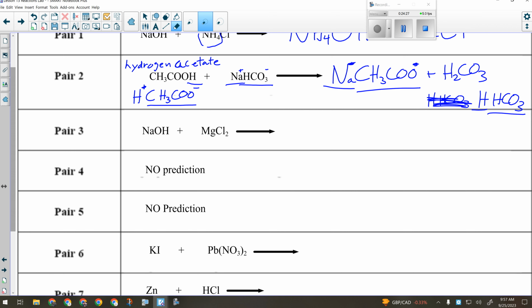Now, what's the other name for sodium hydrogen carbonate? You probably have a box of it in your fridge. Baking soda. What two things are we mixing together here? Vinegar and baking soda, except we're using lab grade. What did vinegar and baking soda do when you mixed them together when you were little? Heavy bubbling fizz. Guess what? That's what's going to happen.